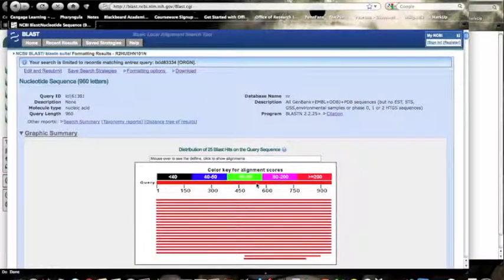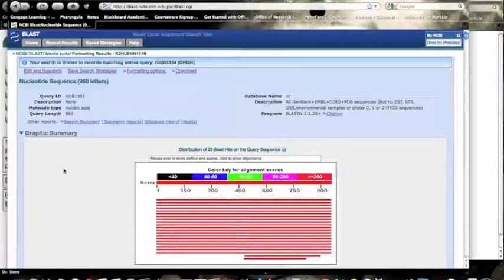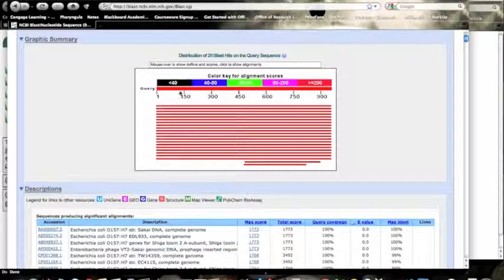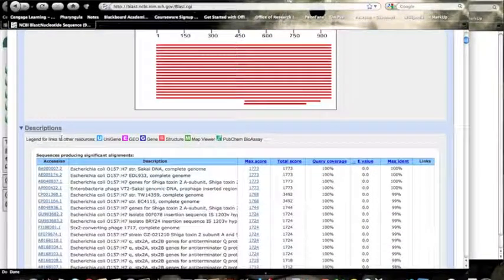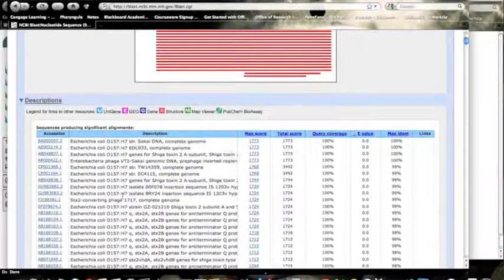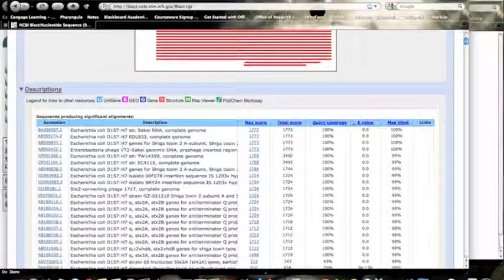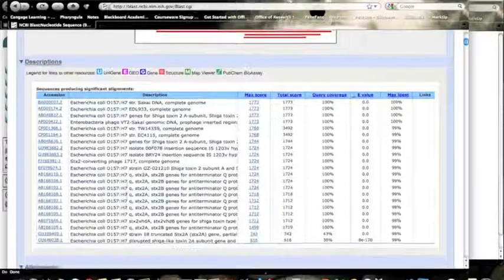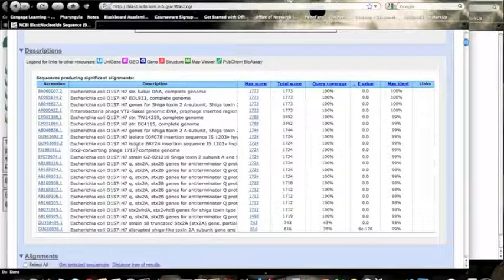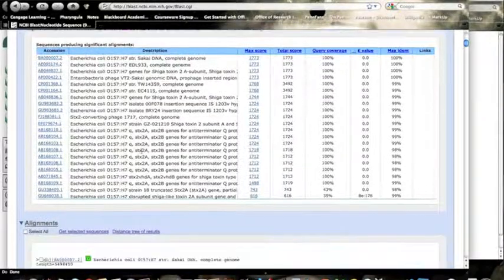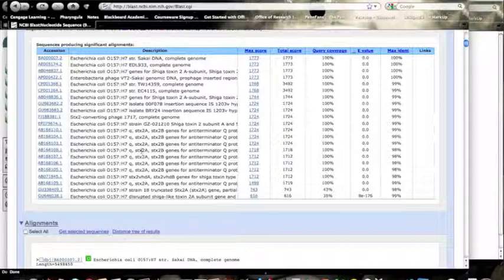Looks like we've got some really good hits. And we'll notice that we have all of the E. coli, and we get some phage, which is interesting, because sometimes these genes will move through a phage. So it could be a transduction event, and I saw that on some of your answer sheets in class.